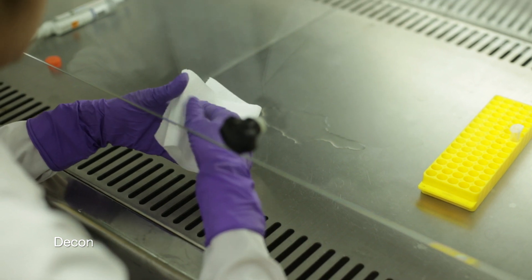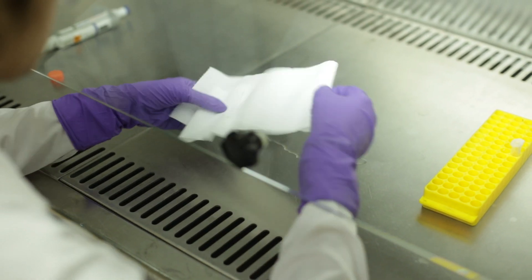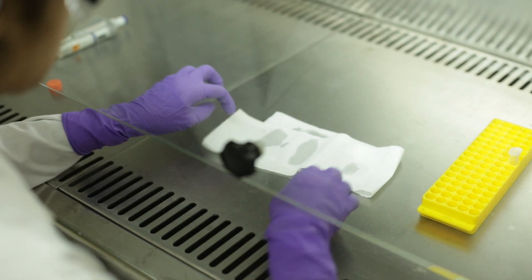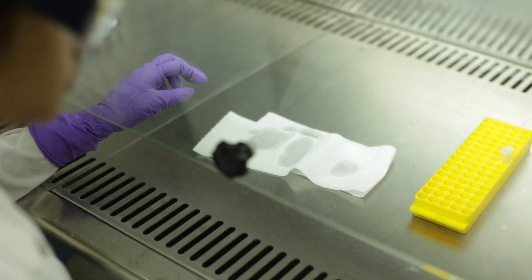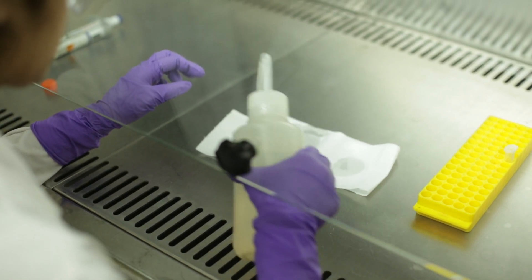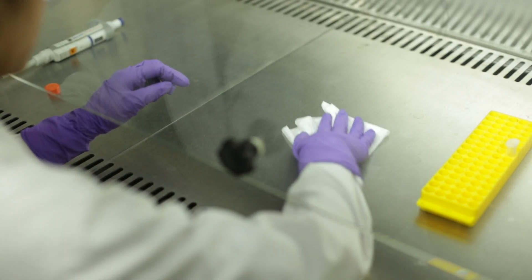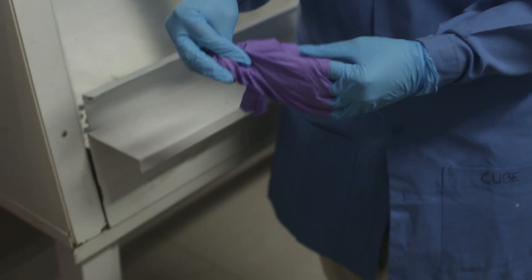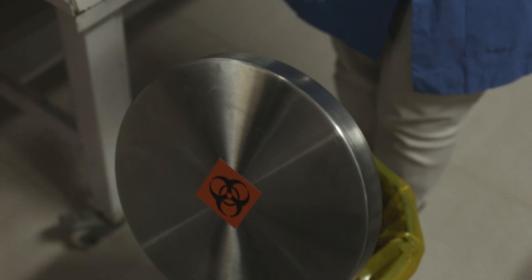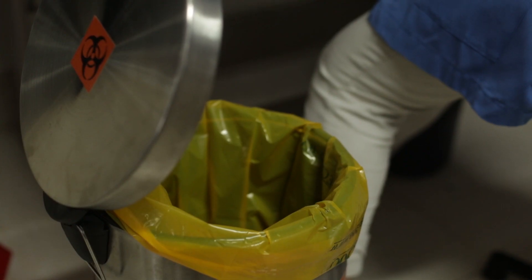Work surfaces must be decontaminated with a suitable disinfectant after completion of work. The method used for decontamination, the concentration, and contact time will depend on the type of biological agent being handled. Yellow bags must be used for collecting biohazard waste for incineration.